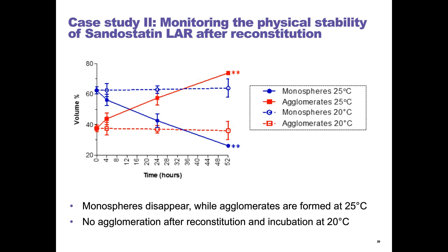So these two case studies showed that MFI provides insights into the effect of different process steps on microparticle characteristics, as well as the extent of microparticle agglomeration after reconstitution.